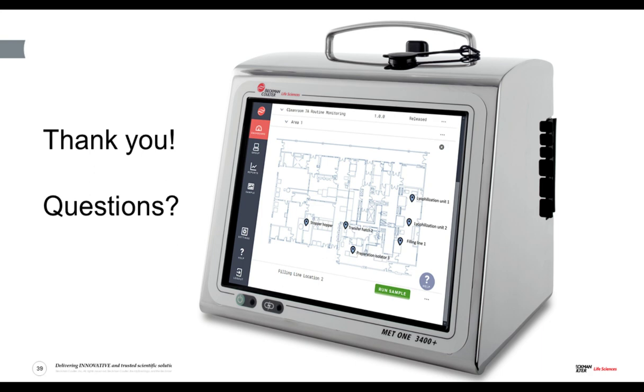Okay, first question, Tony. Thank you for your presentation. Please, can you tell me how you can use a web browser to remotely review and approve daily environmental monitoring data? Is the counter connected to the internet?